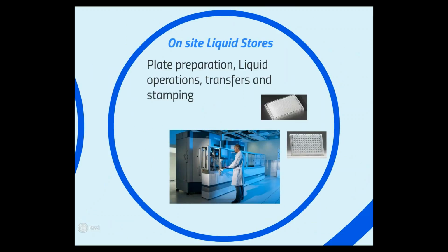In this particular environment also, we're using on-site liquid stores. So we've got highly automated systems that are managing plate preparation, storage of liquid tubes, and of course transferring and stamping plates and racks of materials so they can be used for assay groups and preparation of assay-ready plates.